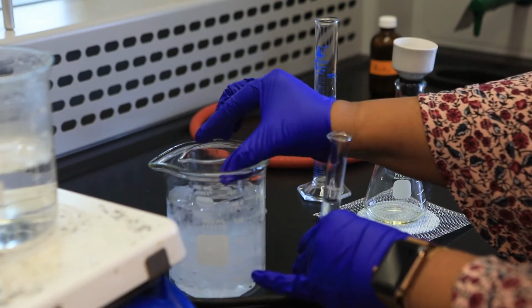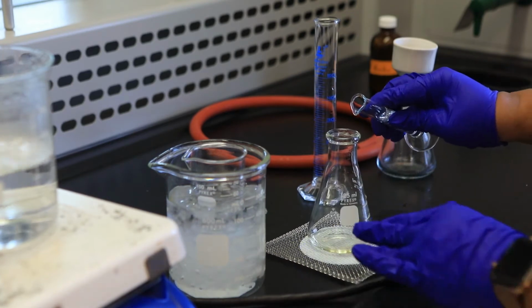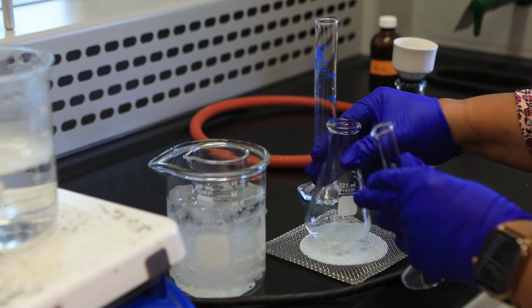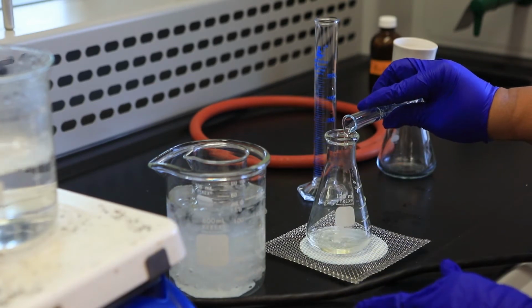Then I'm going to slowly, in about 1 to 2 mL increments, add that to our product. The goal here is that we're going to be initiating crystallization.